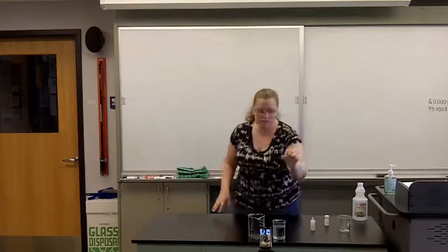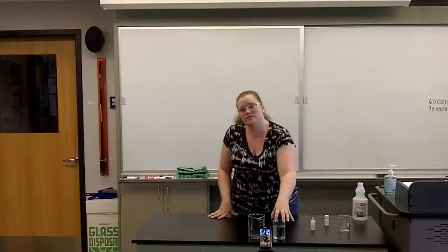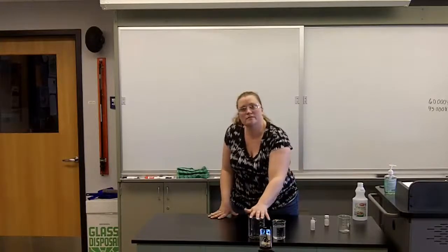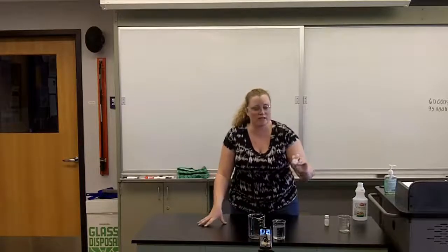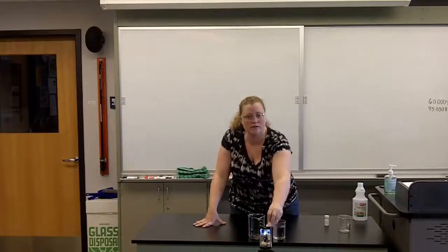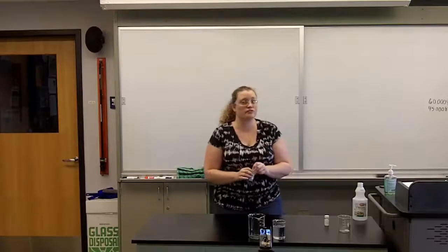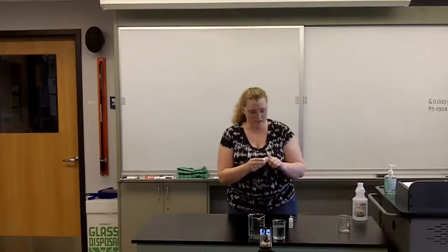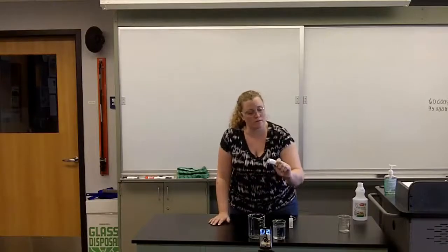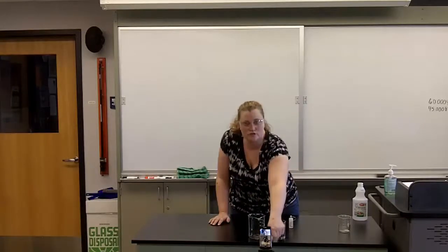So what I have here is a beaker that's full of distilled water and my empty beaker here. What we're going to use is a pH indicator called phenolphthalein which indicates a pH range between 8 to 12, and as our base we're going to use sodium carbonate.